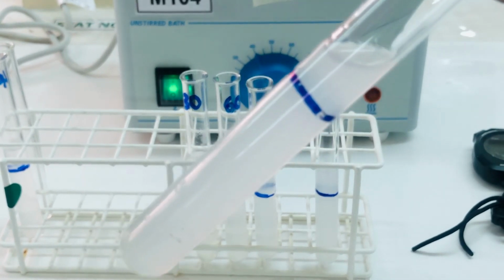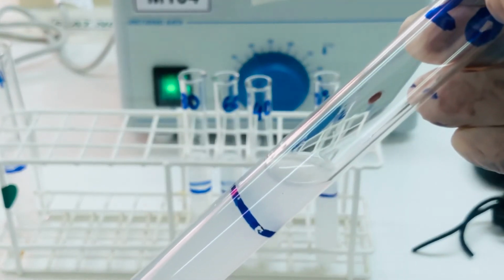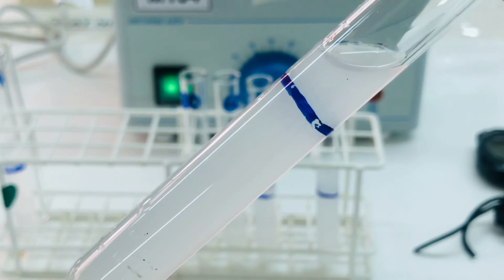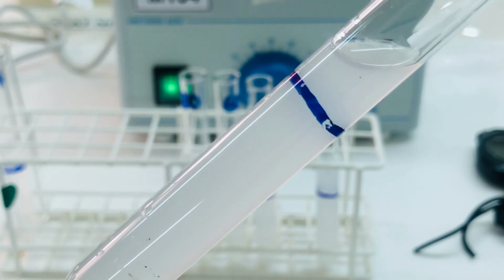For 20 degree, also we have observed there is hardly any change. If you look really closely, you may see some amount of curdling, but the time taken is very, very long.